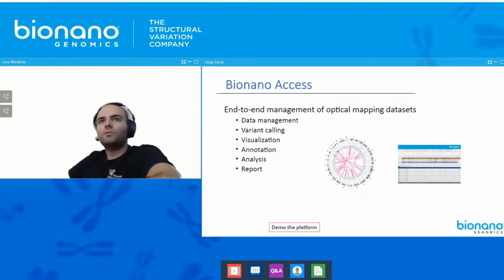So first, I'd like to introduce you to Bionano Access. This is a web-based platform that is designed by Bionano Genomics, and it offers end-to-end management of optical mapping datasets. I've listed a number of points here that we will go through as we go through the demo. So let me share my screen now.